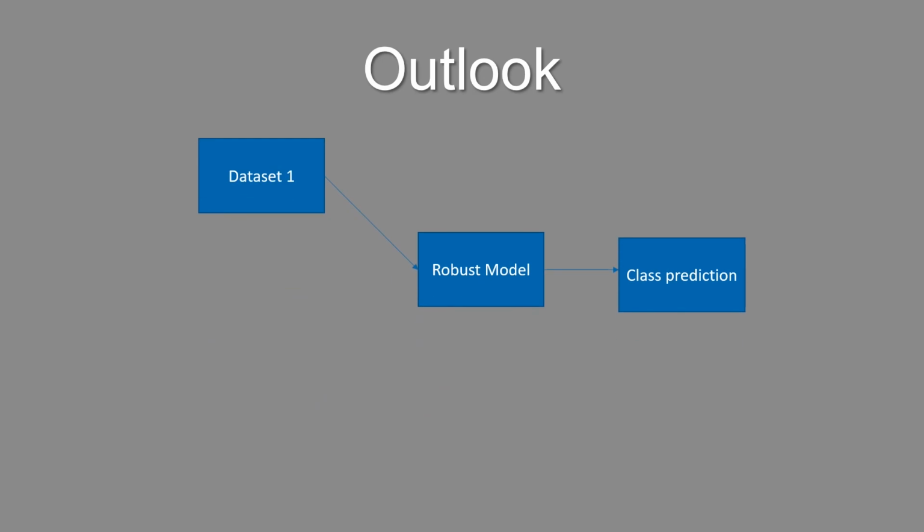Now that we have a model that was trained on a huge dataset of 5,000 samples that performs on the same level as a human expert, the goal of the current work focuses on making these models more robust and adapting these models quicker so that they can be integrated in routine diagnostic settings. What do we mean by making this model robust? These models must be able to work with not only the base data that they were trained on, but datasets that are similar but slightly different, and much smaller than the ones that these models were trained on, and still achieve a good performance.